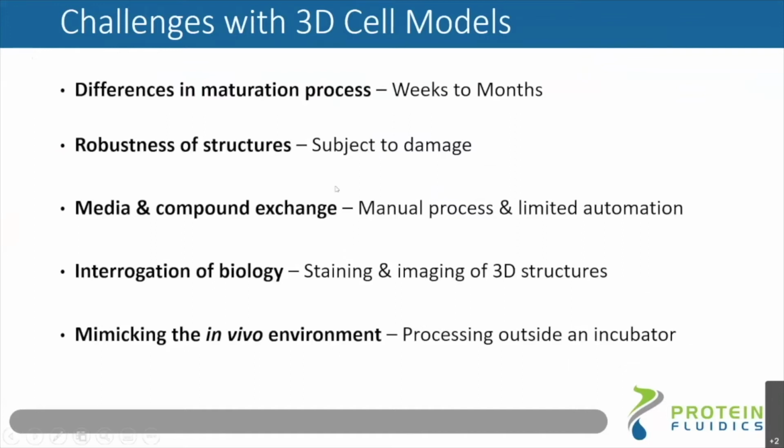And if you've solved all those problems, you want to know how do you interrogate biology. You want to stain, you want to image them, you want to look for the effects of the compounds on the biology, and all the while maintaining as much of an in vivo environment as you can.